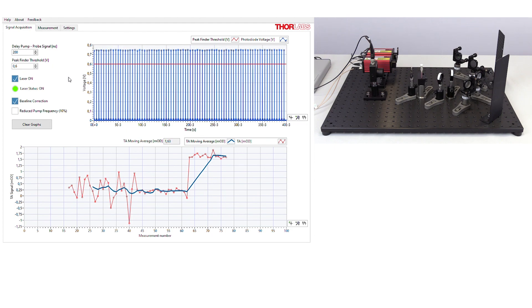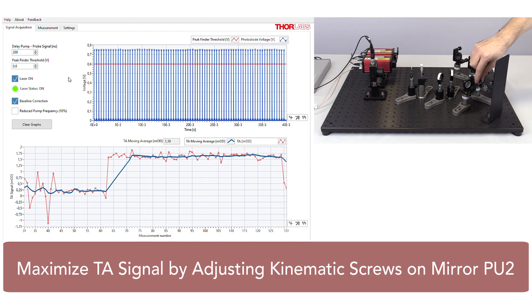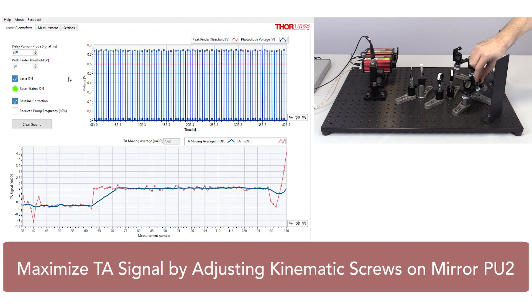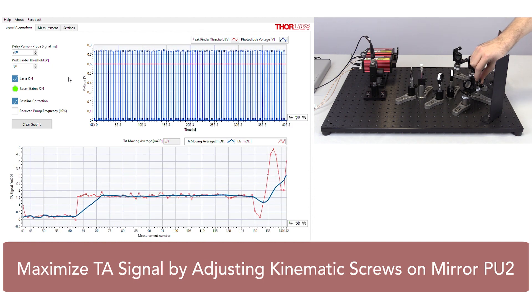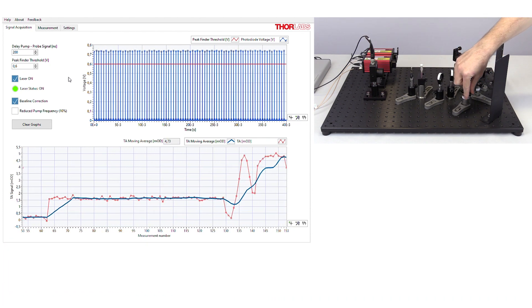Using the transient signal live feed graph for guidance, adjust one knob on the mirror to see how the signal responds. This is the red trace in the lower graph. After one axis is maximized, adjust the second one.